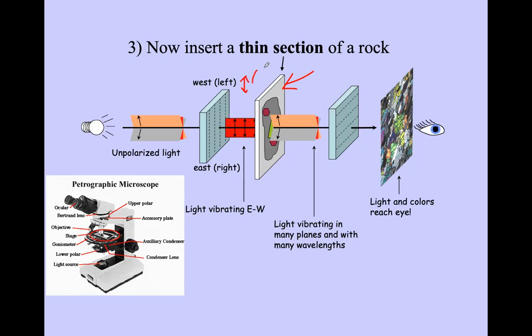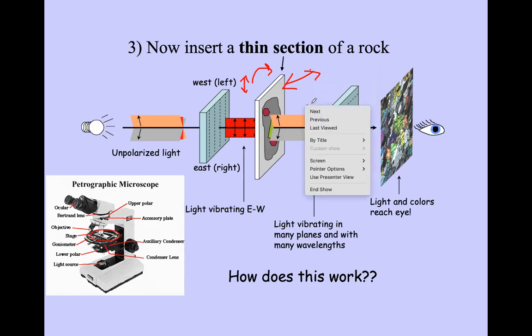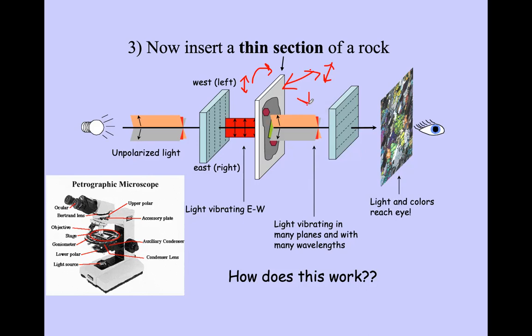They will be changing to other directions, for example, this direction. So the light coming after the sample will have some other directions, not only this direction, but also maybe some other directions, because the minerals in this thin section will be in variable orientations. Therefore, they will not only orient along this direction, but also maybe some other directions, right?